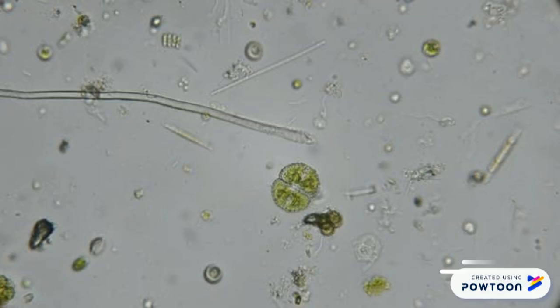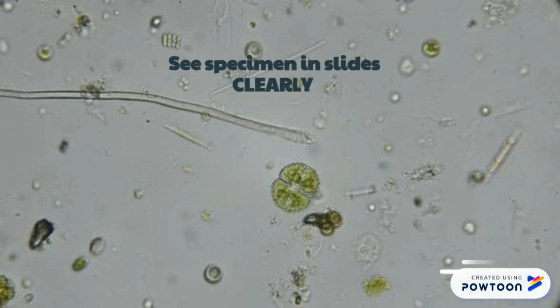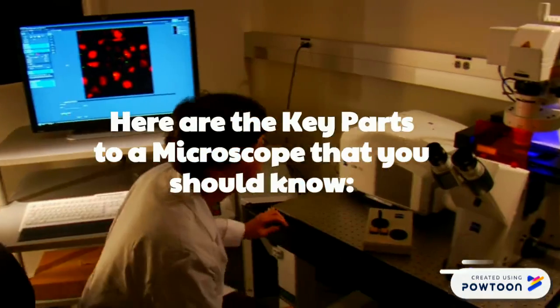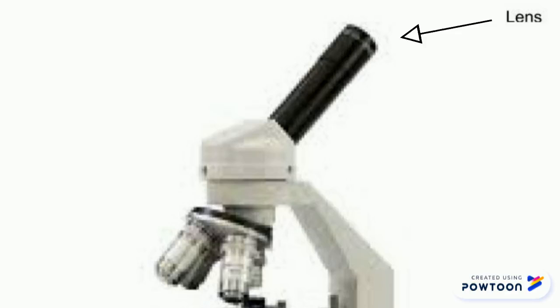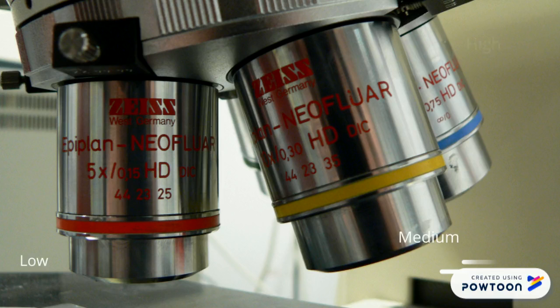The boreal microscope is made of good quality parts that allow you to see specimens in slides clearly, such as this slide with murky pond water. Here are the key parts to a microscope that you should know. To examine the image, you look through the lens. There are 3 magnifications. There is a low power, 40 times, medium power, 100 times, and high power, 400 times. These magnifications allow you to zoom in or out of the object, so you're able to get the most detailed image.